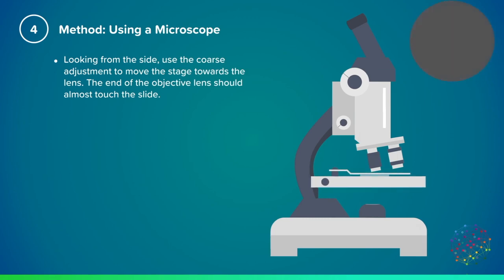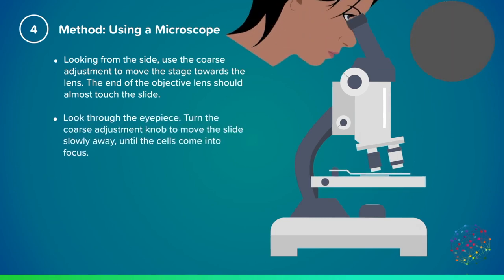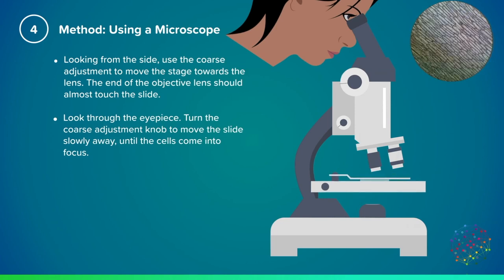Turning the microscope on now, you can look through the eyepiece. You can again turn the coarse adjustment knob to slowly move the slide away, until the cells come into focus in the field of view, as you can see on the right hand side.